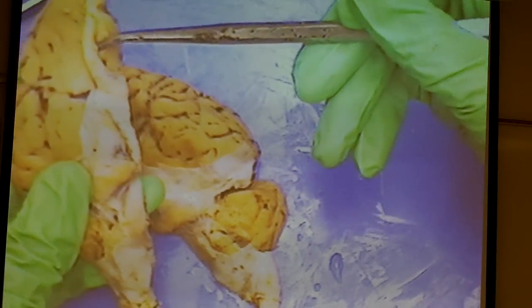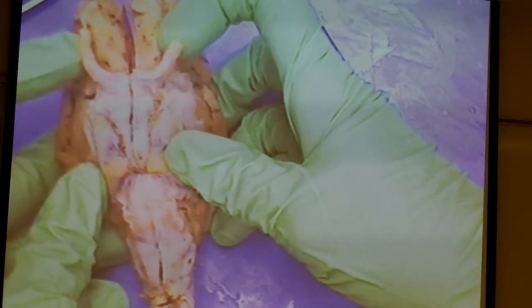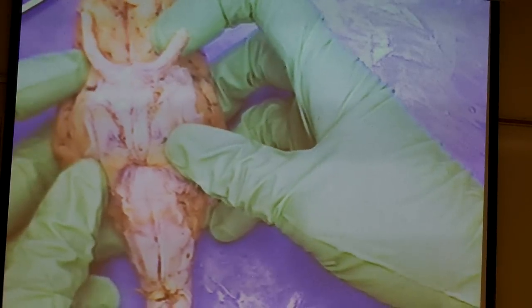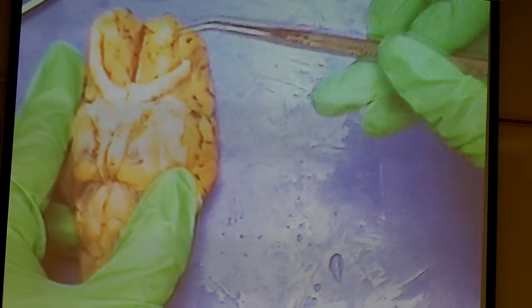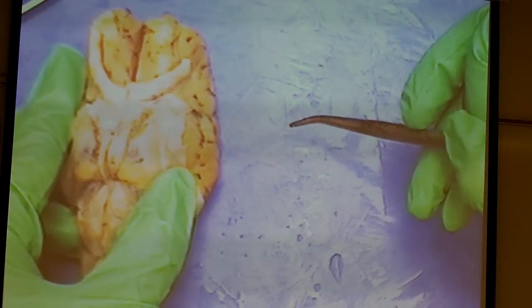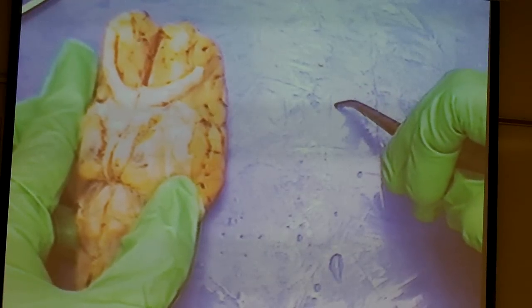The next one to find is this branch of the optic nerve. Both of these right here are the two optic nerves. A nerve is a collection of axons outside of the central nervous system. You'll notice that right here they're forming the optic chiasm — this is where hemidecussation is occurring. Some fibers stay on the same side of the brain, and some cross over to the other side. Hemi means half; decussation means to cross over. After the optic chiasm, these axons continue inside the brain, so we call it the optic tract.